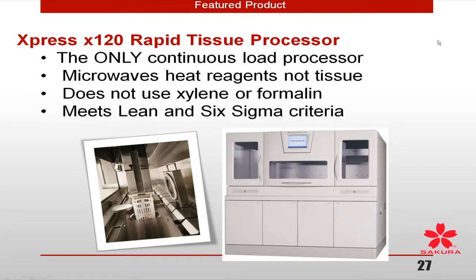It is a learning process, but it does demand, if you're going to go to rapid processing and you're not going to have all diagnostic endoscopic biopsies that are 0.1, 0.2, 0.3 millimeters, that you learn how to make that tissue sample. It is not something that everybody already knows.